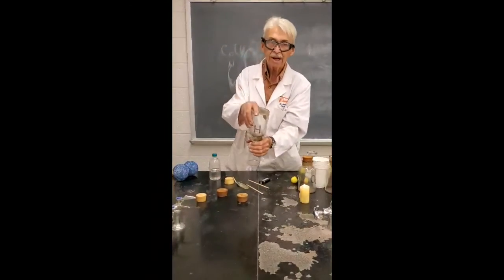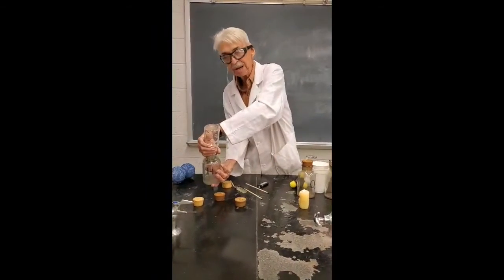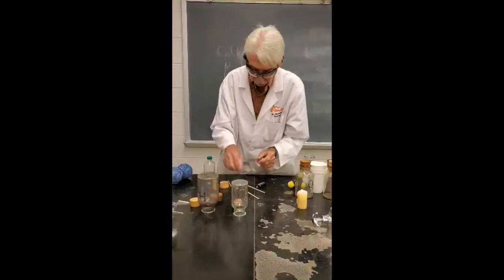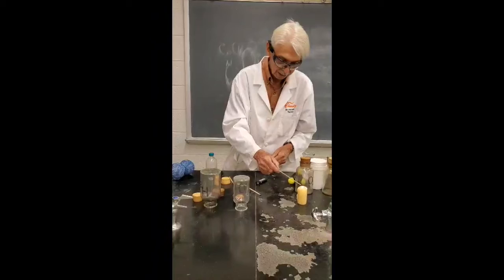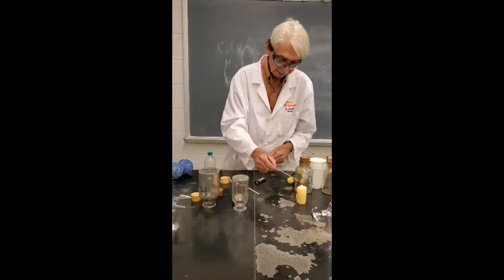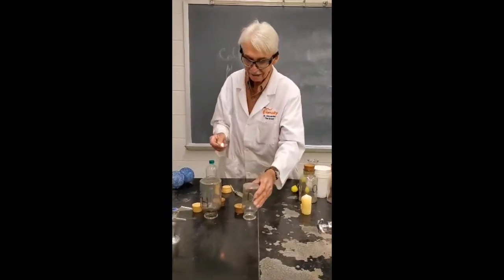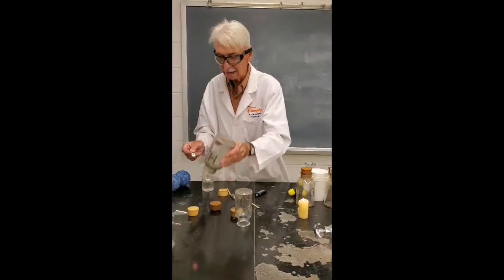And if it's mixed, it should be in the small one too, right? So let's see if it's in the small one. I don't think the explosions will be so loud. Let's see. See? Not nearly as loud. So let's go light the big one then.